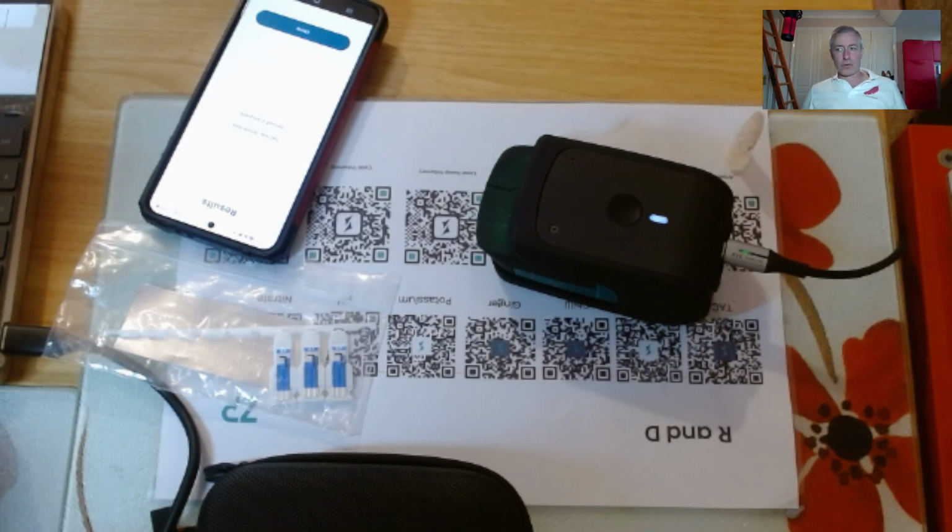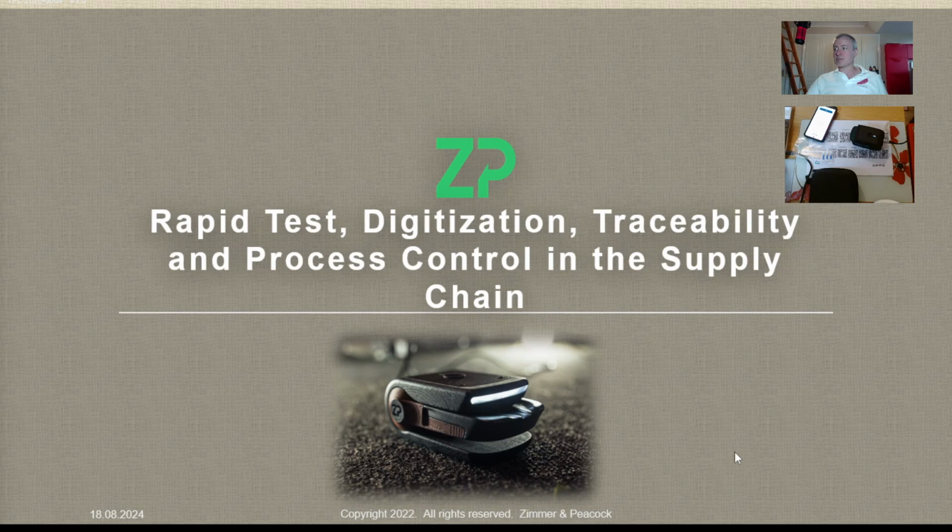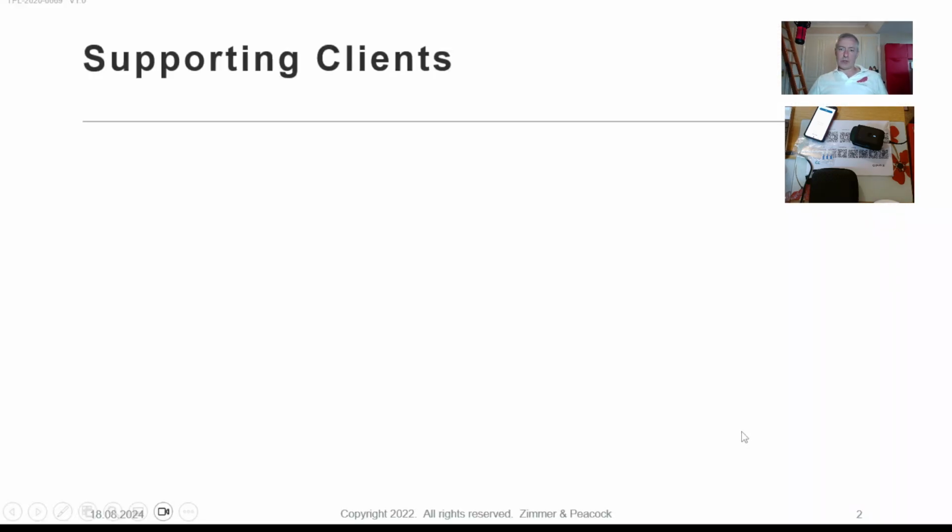That said, let me go forward and do this quick demonstration. So I'm just going to go back to these slides really quickly. I will be doing a quick test of a chili sample, but really it's more about doing some calculations for you as well.